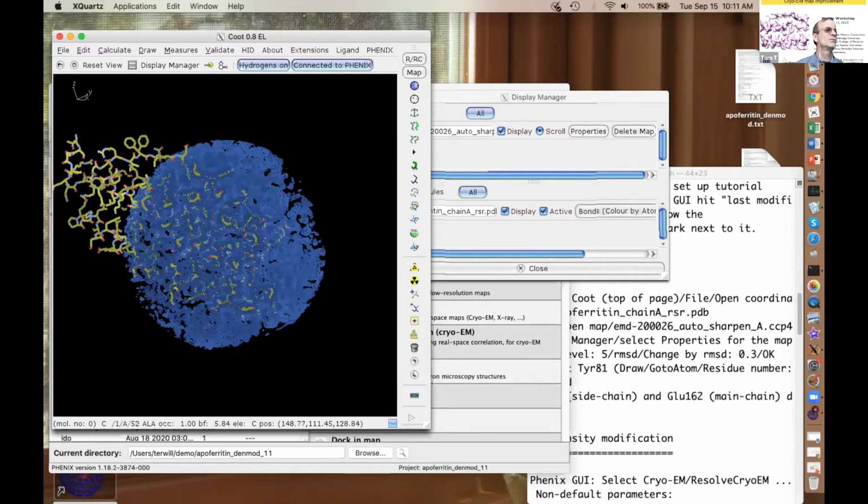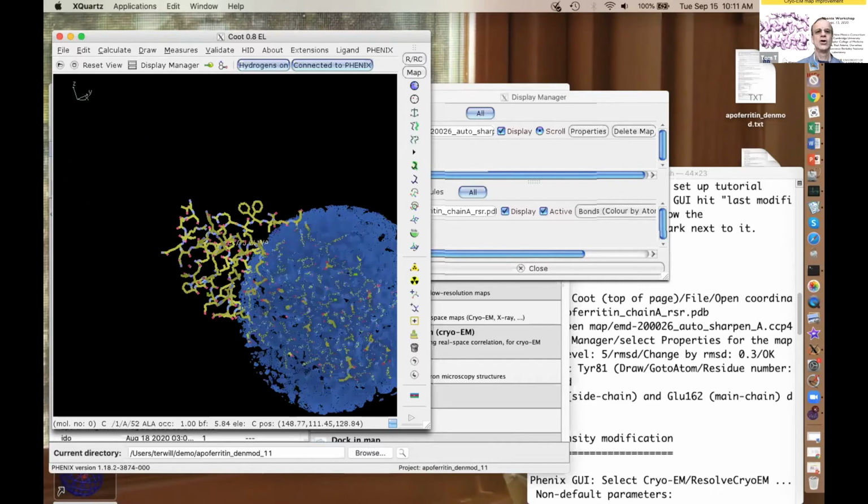Yes, Claudia, it was a 5 sigma and step of 0.3. That works well. Yeah, so I guess somebody else answered that. Thanks, Dorothy.